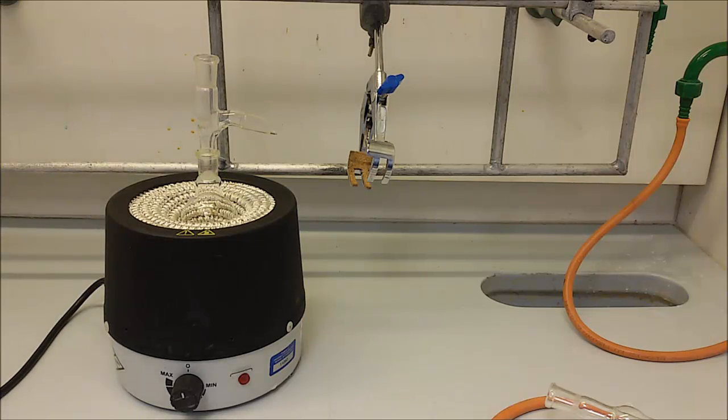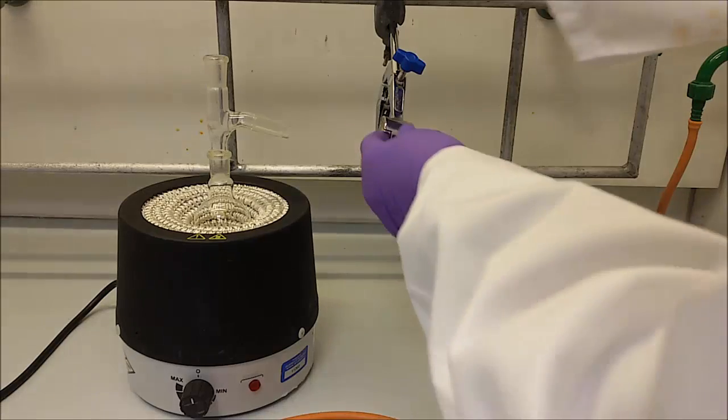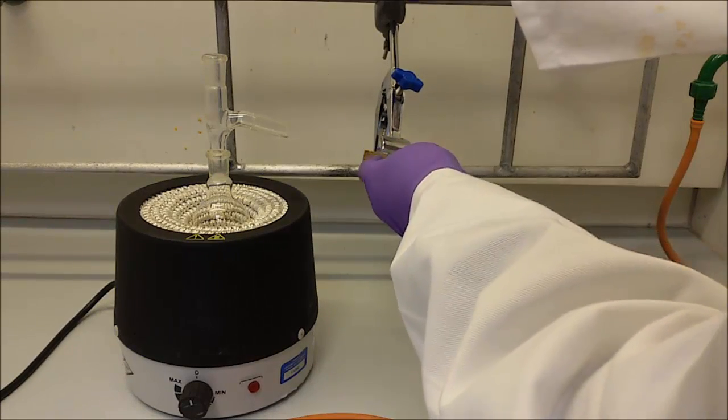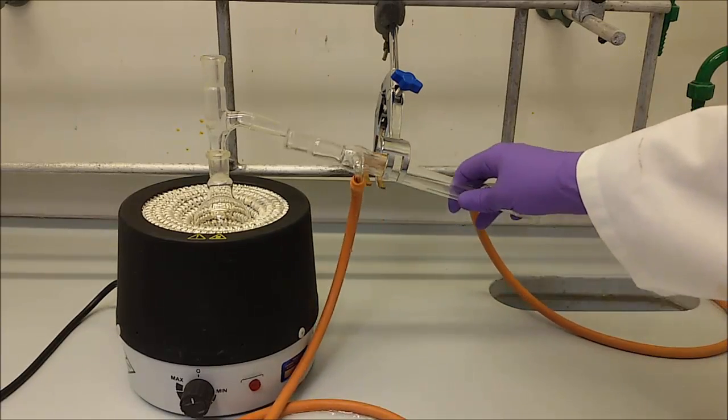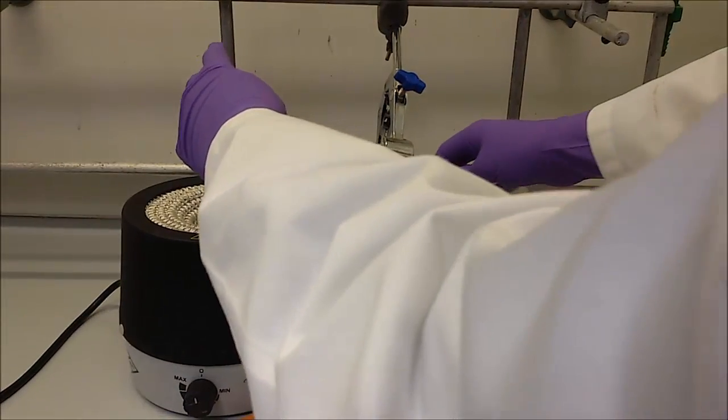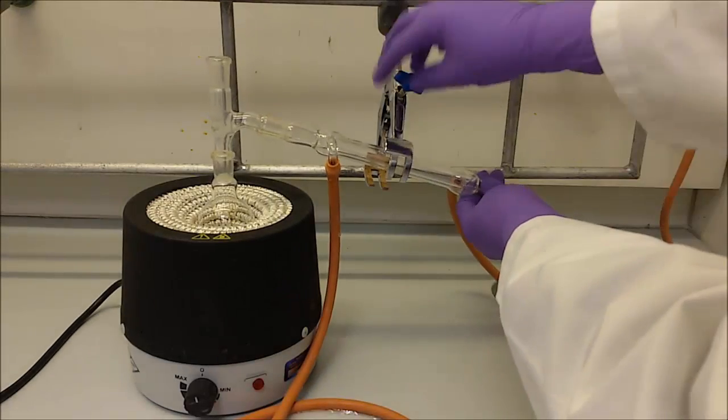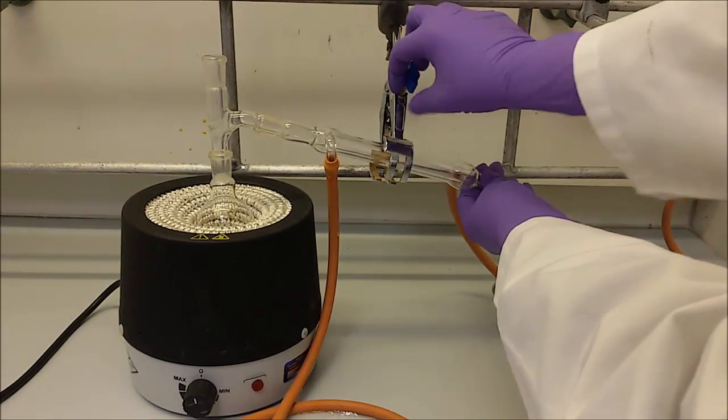The clamp next to the mantle will be used to clamp the condenser. Estimate the position of the condenser that will make the round bottom flask in approximately vertical position and fit the condenser. Again, make sure not to break the glass.